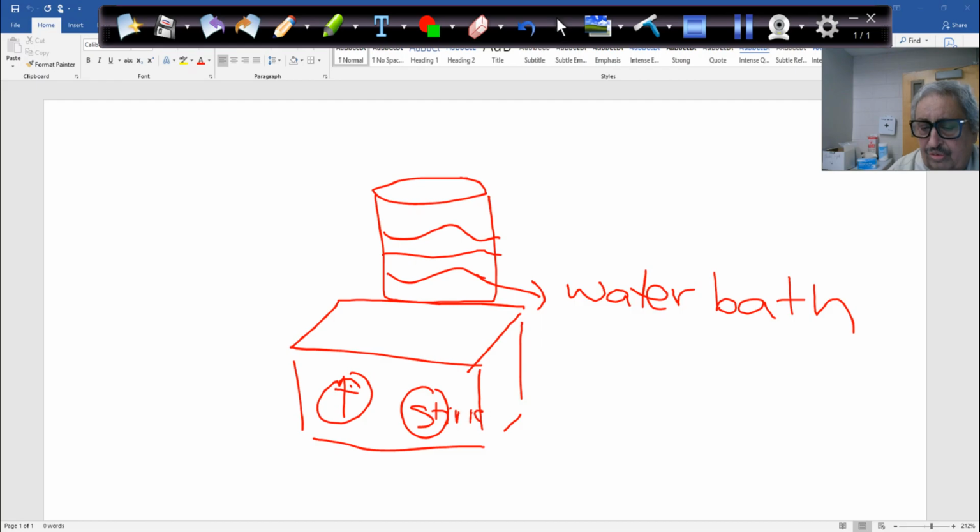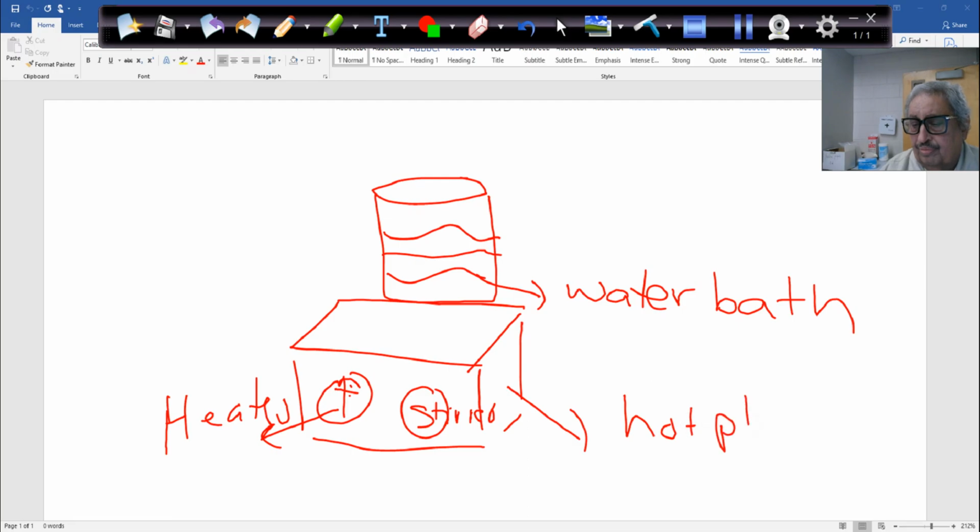Take it off, so that's the stirrer off. That's the heater. We are using the heater, correct? So this is a hot plate. The first thing you'll start doing is turn on this hot plate. It takes time for the tap water to boil. So you boil this one here, and meantime you will have your components there.